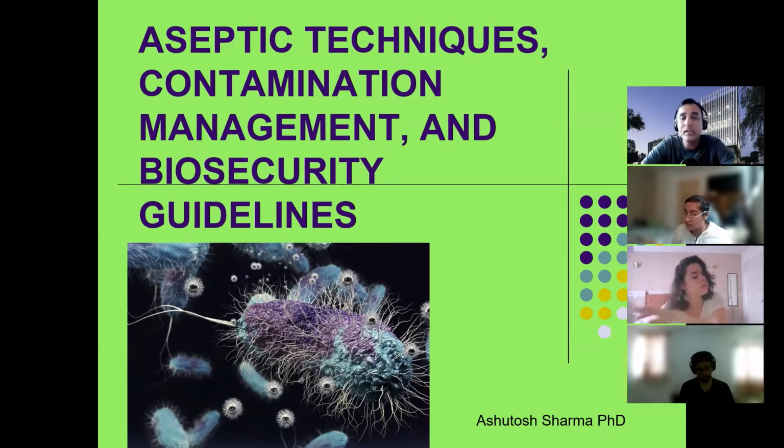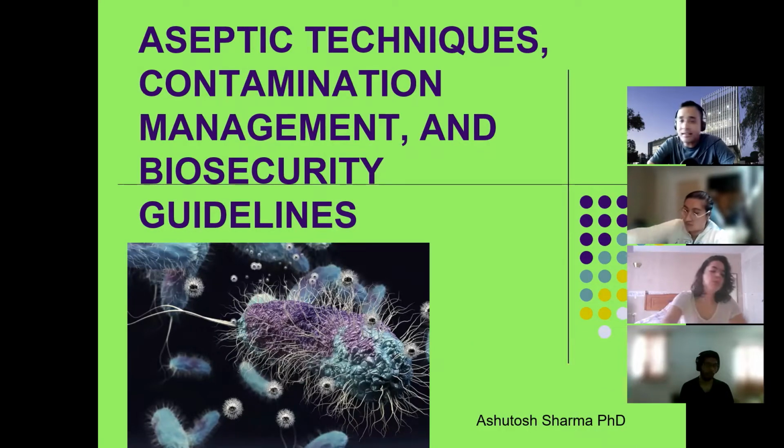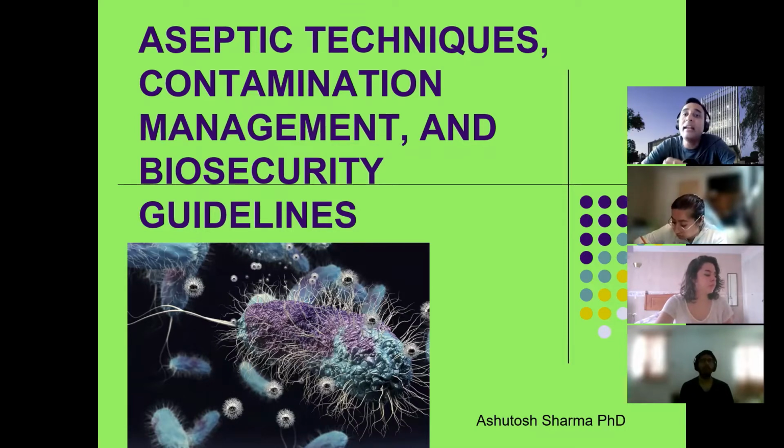the lab, right? And the biosecurity levels, that is another very important issue, that every lab has to be designated as level 1, level 2, level 3, and level 4 laboratory. We call it biosafety level 1, 2, 3, 4. Okay, so that is also another thing. And the fourth one is how to work in a tissue culture lab, the best practices of working in a laboratory.